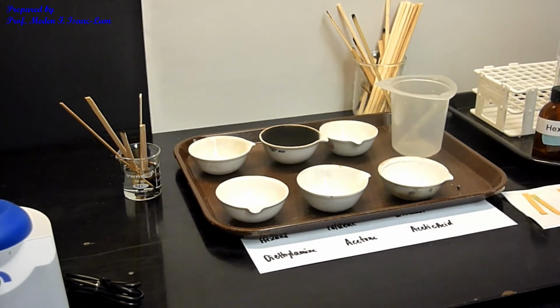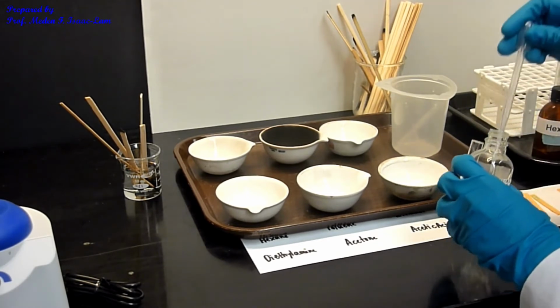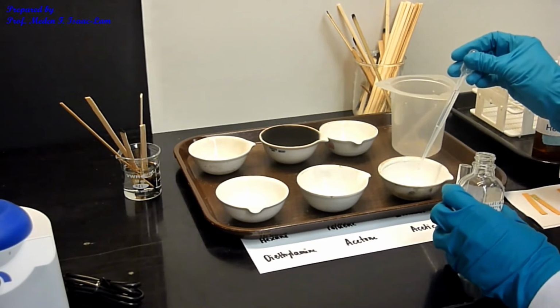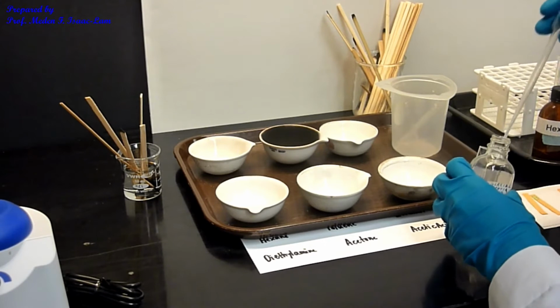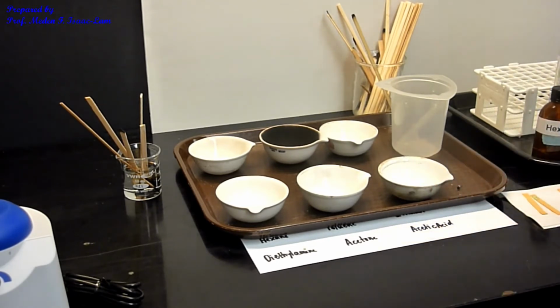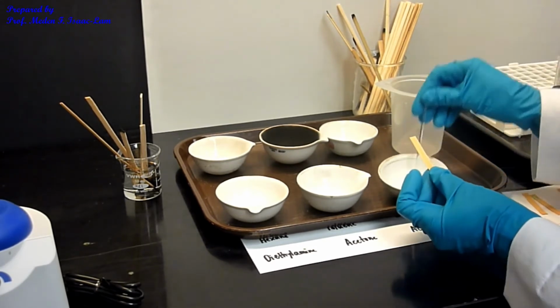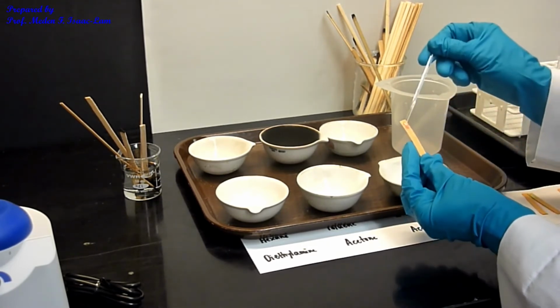All right, so now acetic acid. So you probably will guess what it should look like, right? So 1, 2, 3, 4, 5, 6, 7, 8. Okay, so now I'm gonna use this one. So again, stir stick. So see, it's red.